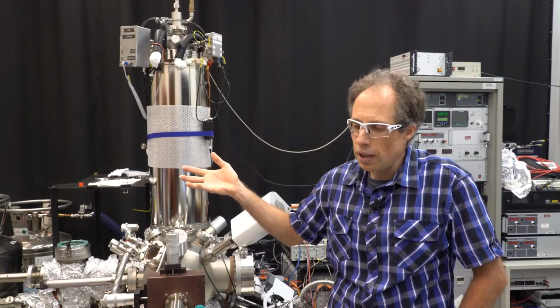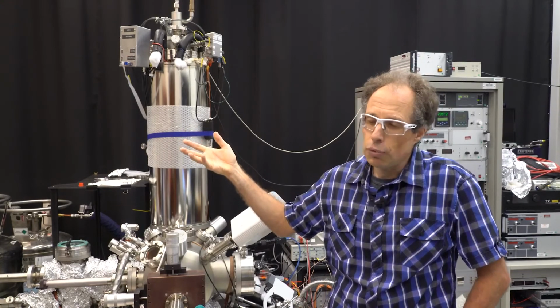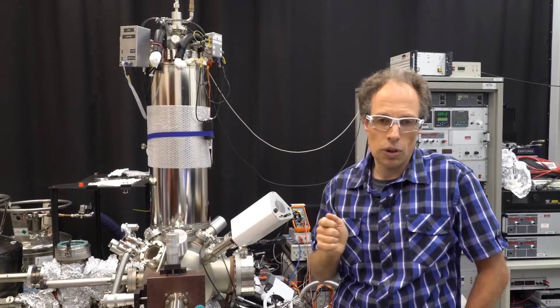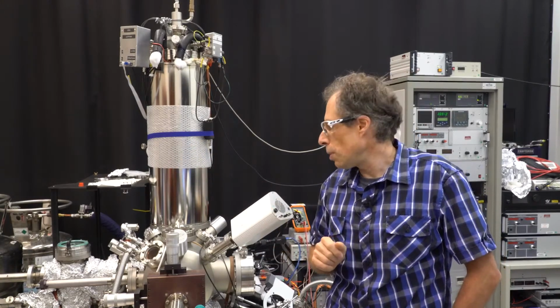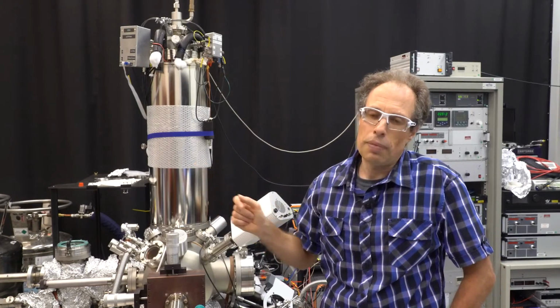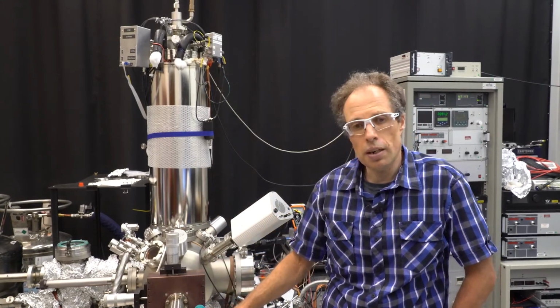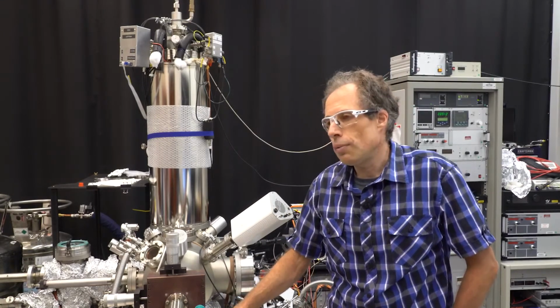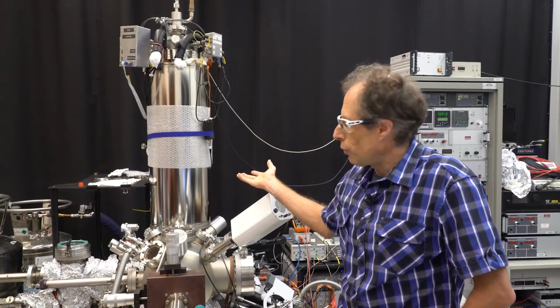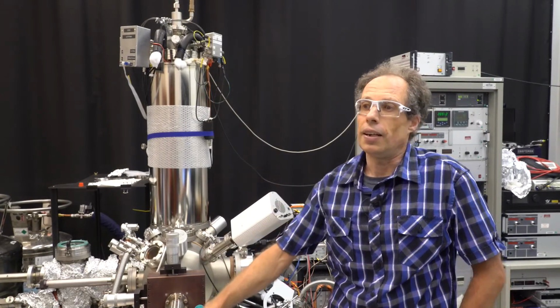We may not be able to look at a million different molecules because we are running out of time. But we can look at single ones and get some idea of what's going on there. And that's one of the purposes these machines can be used for, beyond many, many other physical and basic chemical properties we can analyze with this machine. And so I hope it gives you some idea what a scanning tunneling or scanning atomic force microscope is. I'm open for questions later. Thank you.